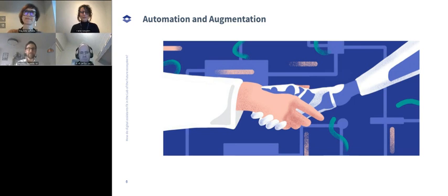And that's why I think, especially in big pharma or in the life science space, you will always have things more like a connected lab, with some digital flavor and digital assistance, or automation. And you then gradually grow those automation platforms. And I think then the decisive point is that you want to connect those different automation islands and platforms. And for that, for sure, you need a digital lab assistant.